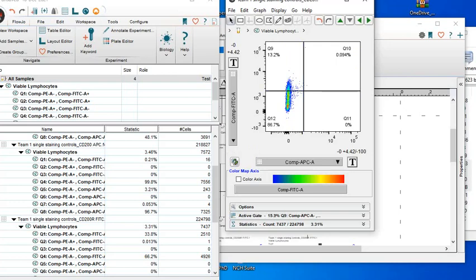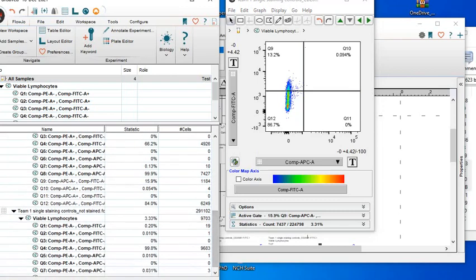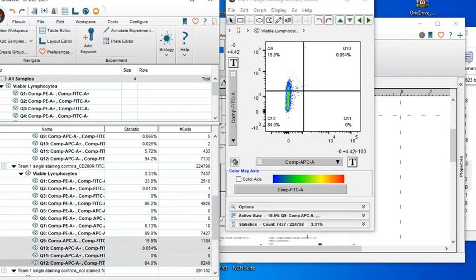Okay. And we do the same thing, and we drop. Congratulations, you have succeeded in doing that.